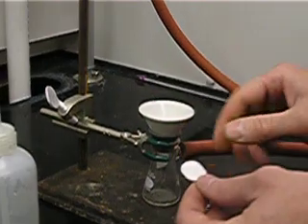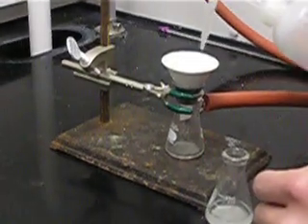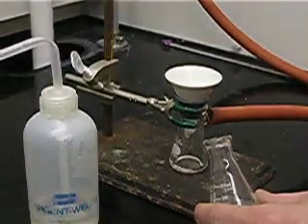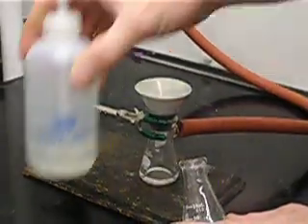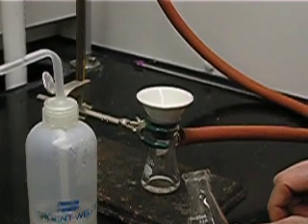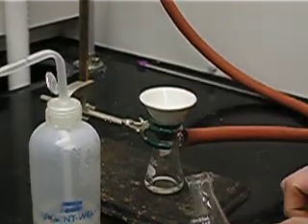We now take our filter paper, place it in the Hirsch funnel, and wet that paper with whatever solvent is being used to wash the solid. In this case we are using water — just a couple drops to wet the paper. You heard the difference in the sound of the aspirator as soon as the water was added.